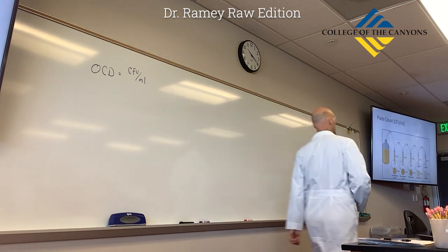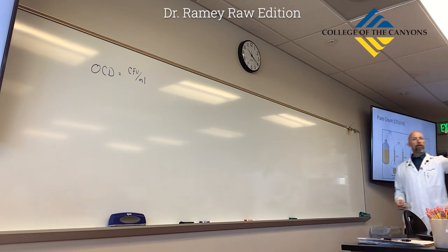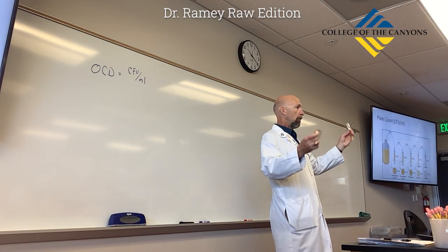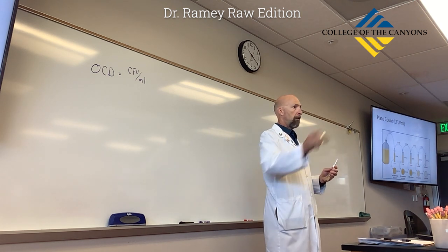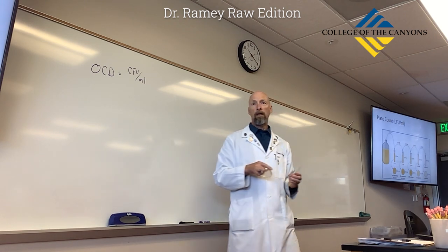And let's say this is one of your cultures. Let's say this is the culture right here that you want to determine the OCD of. You're going to do this with the E. coli cultures that you inoculated on Tuesday that are now in the incubator. Those are the cultures you're going to determine the OCD of.